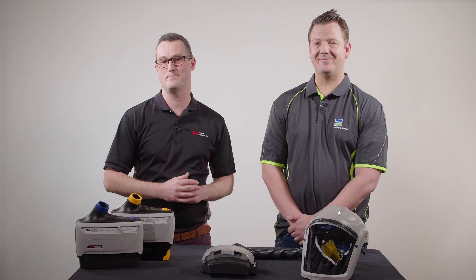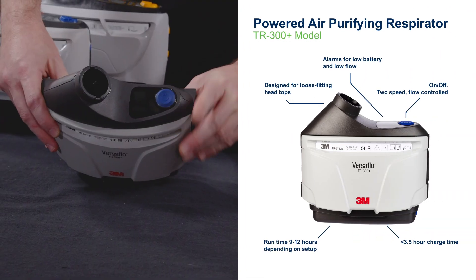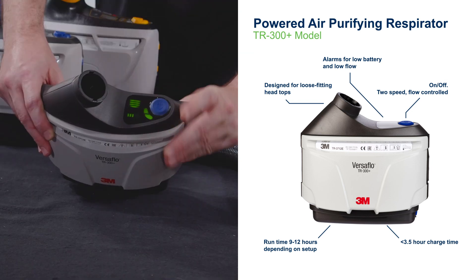Good question. A PAPR is a Powered Air Purifying Respirator, which is a type of respirator that has a fan in the blower that draws the air through a filter into a head top to provide comfortable air for the person to breathe.